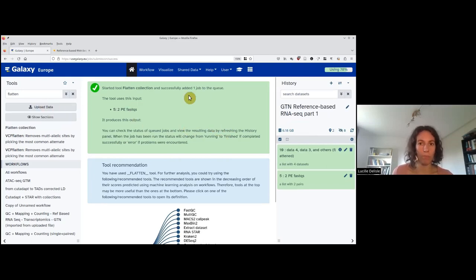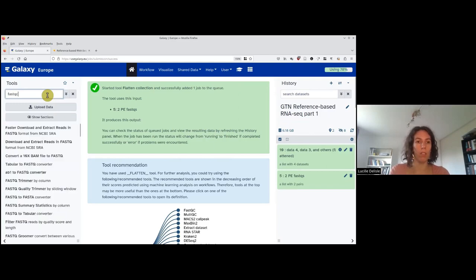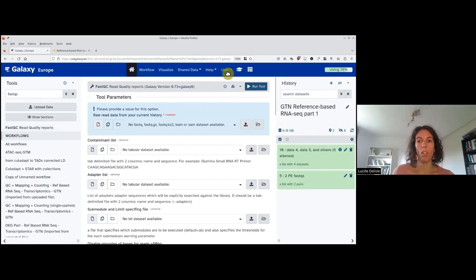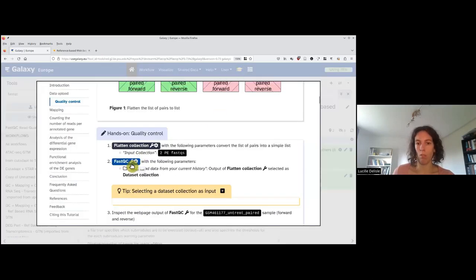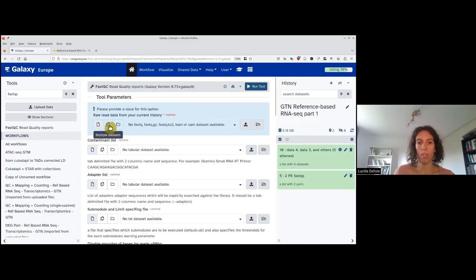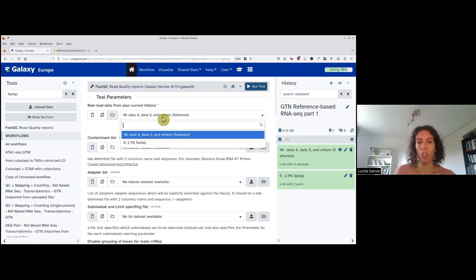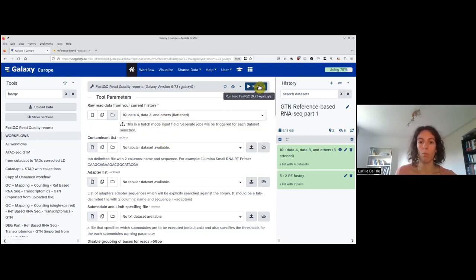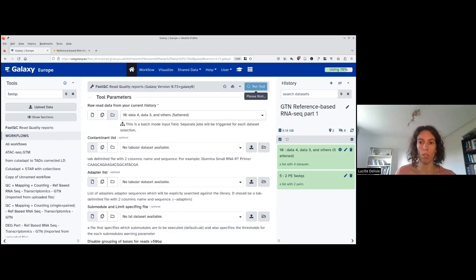Now we are ready to run FastQC. You can either search for it in the tool search on the left, or click on FastQC in the training material. We will run FastQC with default parameters. For the raw reads parameter, we need to provide the flattened collection — click on 'Dataset Collection' and select the flattened collection. We can then use the 'Run Tool' button on top. This launches FastQC in parallel on all four FASTQs, generating a web page and raw statistics for each of the four files.